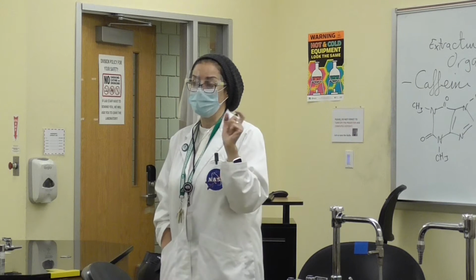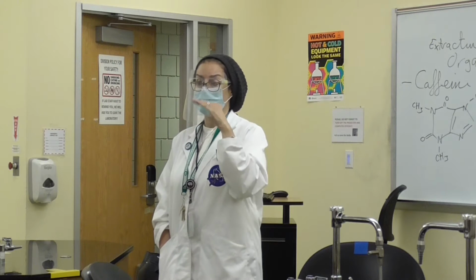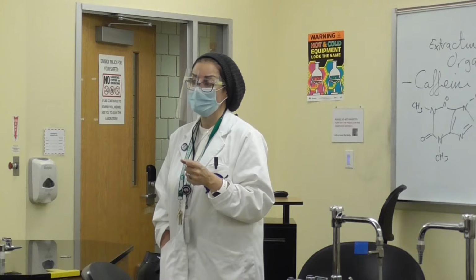Sometimes when we shake it vigorously, it is going to create an emulsion between the 2 layers, the water layer and the methylene chloride, okay?